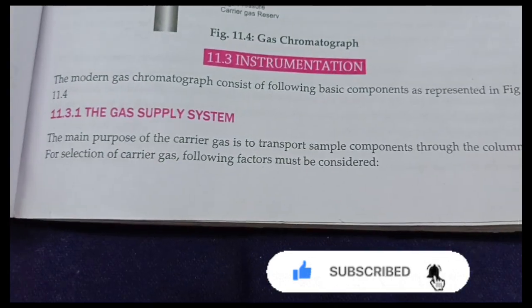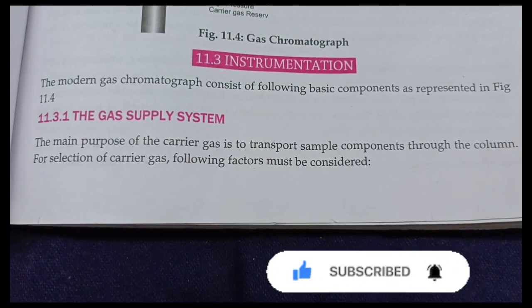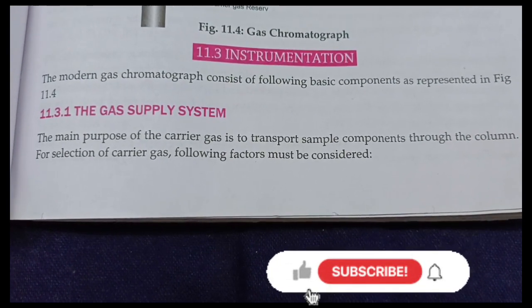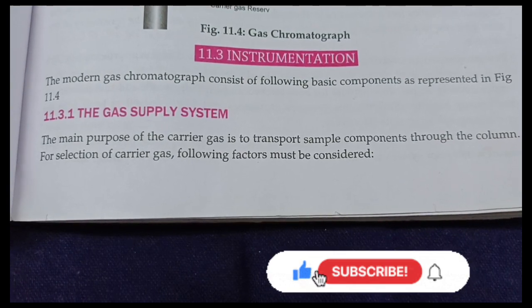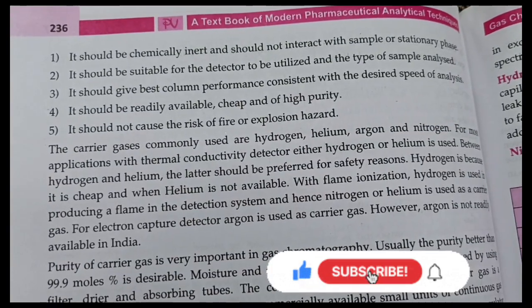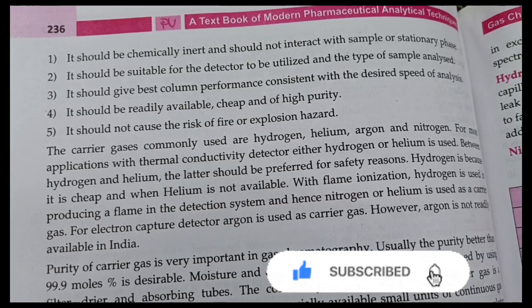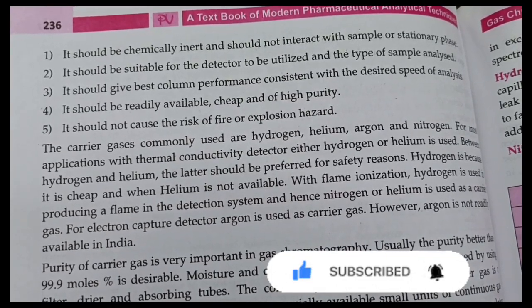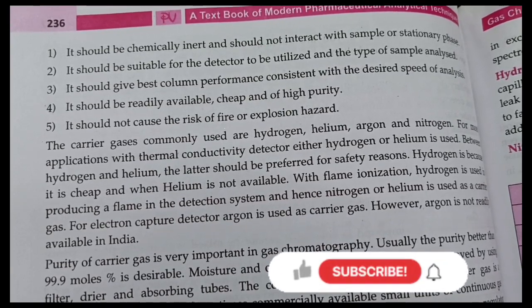The gas supply system: the main purpose of carrier gas is to transport the sample components through a column. For selection of carrier gas, the following factors must be considered. It should be chemically inert. It should be suitable for the detector to be utilized and the type of sample analyzed. It should give the best column performance.